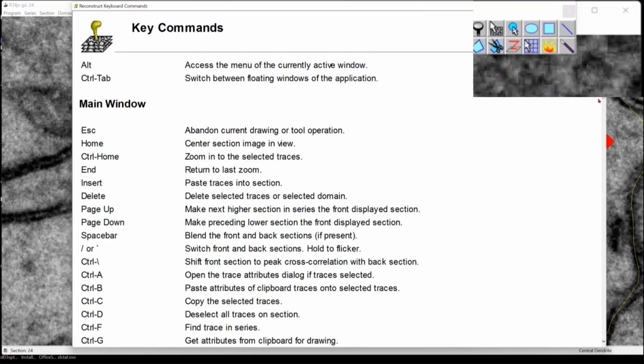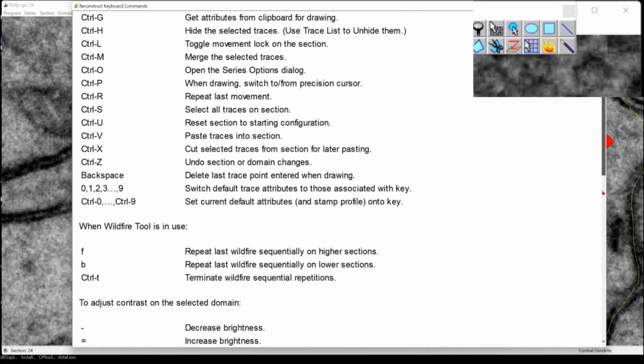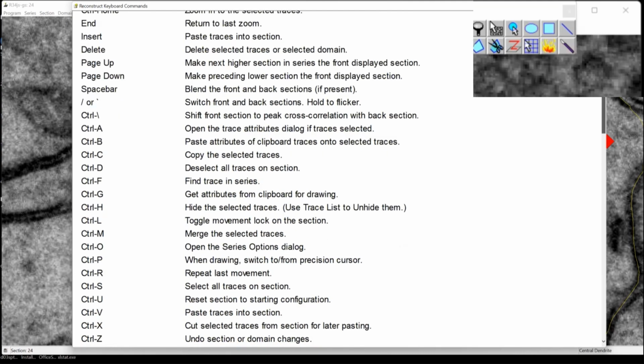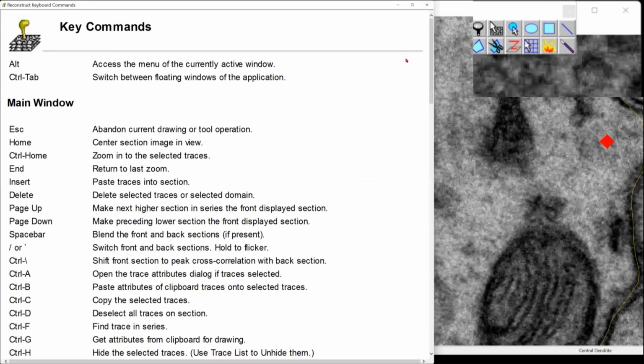Yes, I have thought of a couple of ways, because in thinking of an Adobe Lightroom kind of resemblance, you can have all that metadata automatically populated from whoever is, let's say, logging in or using it. So it can be logged automatically as opposed to having to type it in all the time.